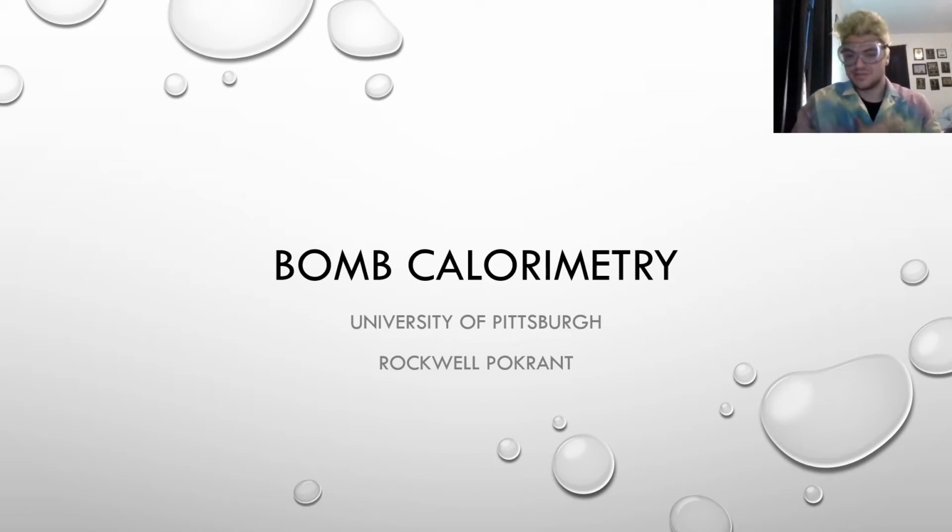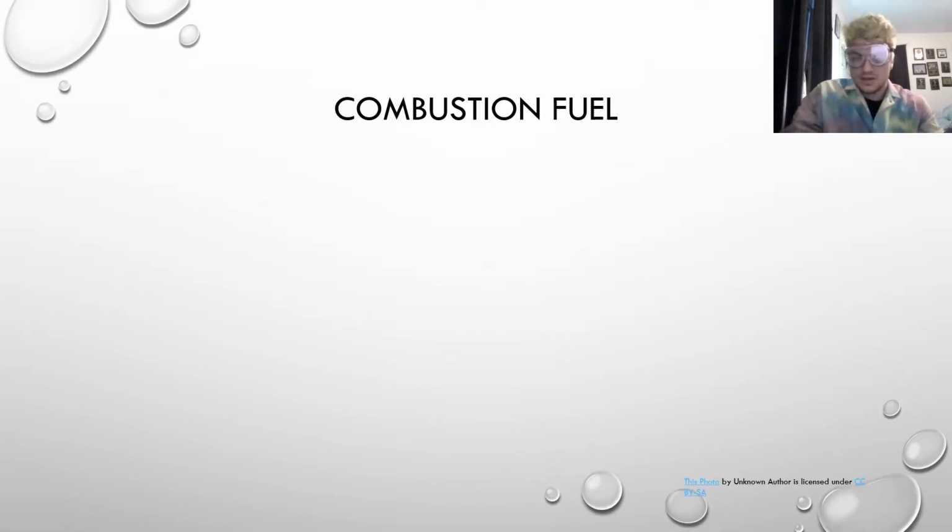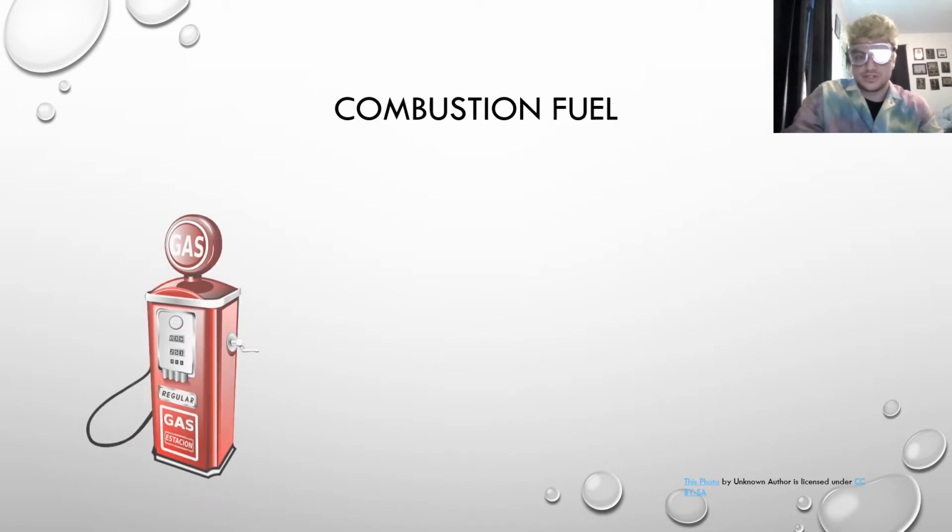As you can see, I'm in my lab coat and safety goggles because safety is a priority here at the University of Pittsburgh. For today's experiment, we're going to be talking about bomb calorimetry. Now, bomb calorimetry is very interesting because you can use it to find enthalpy of combustion.